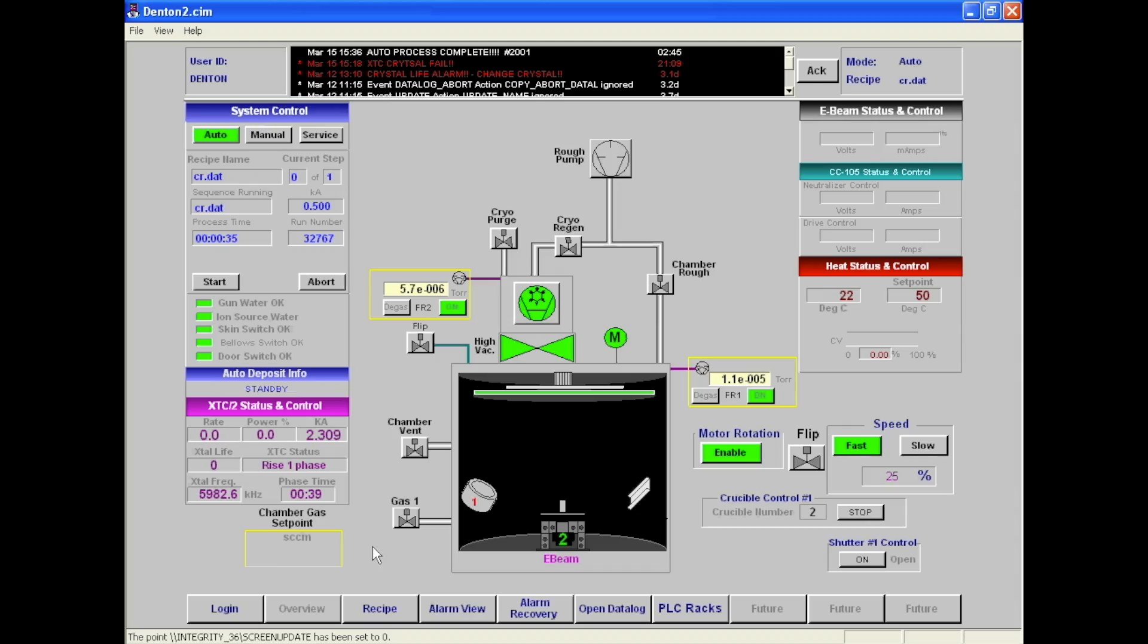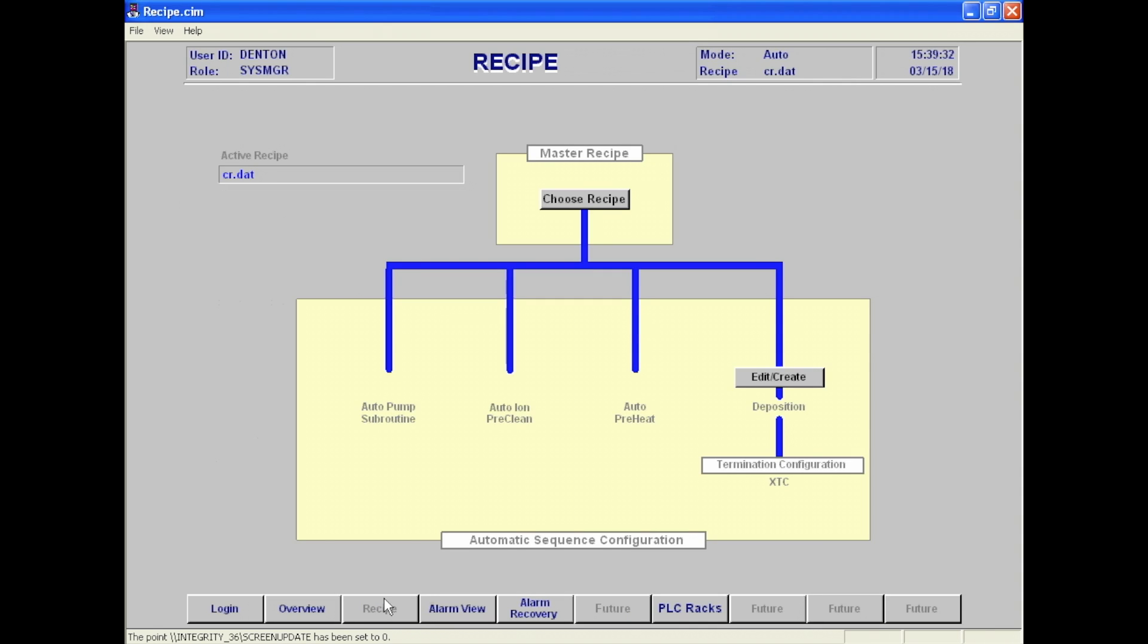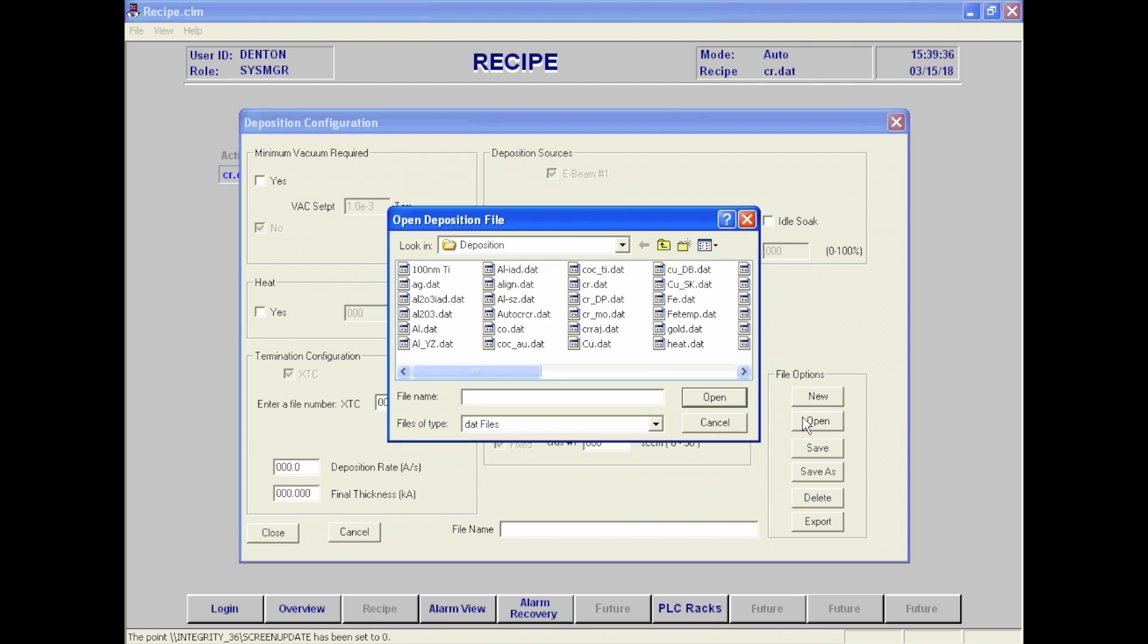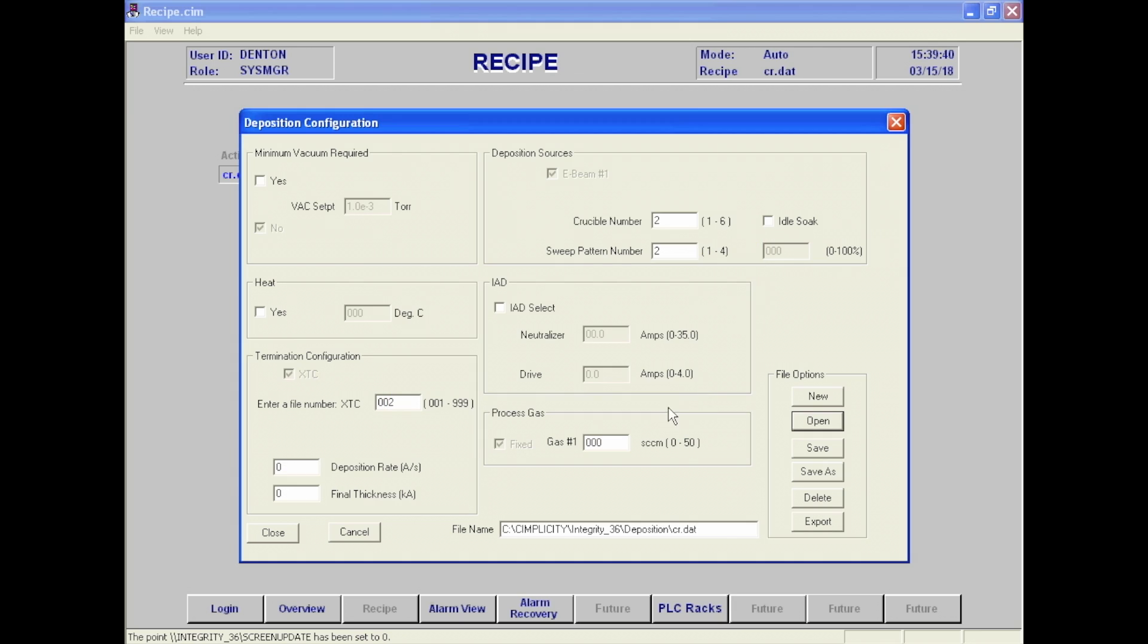To begin running the process, click recipe again at the overview screen. Then click edit/create. Click open under file options and open the desired recipe. For the purposes of this training video, we will be using cr.dat.